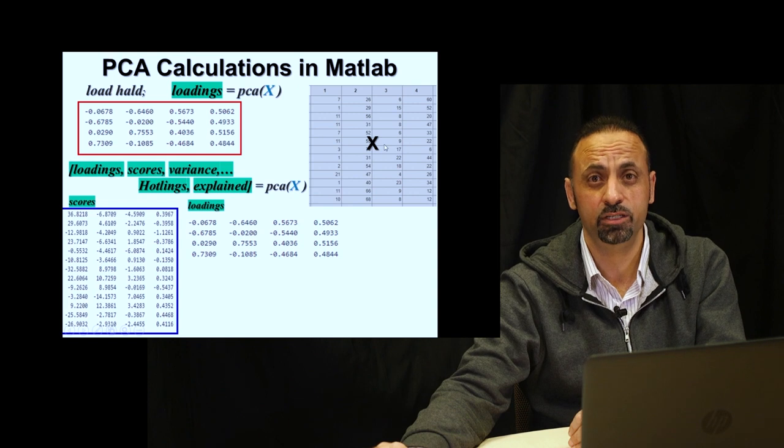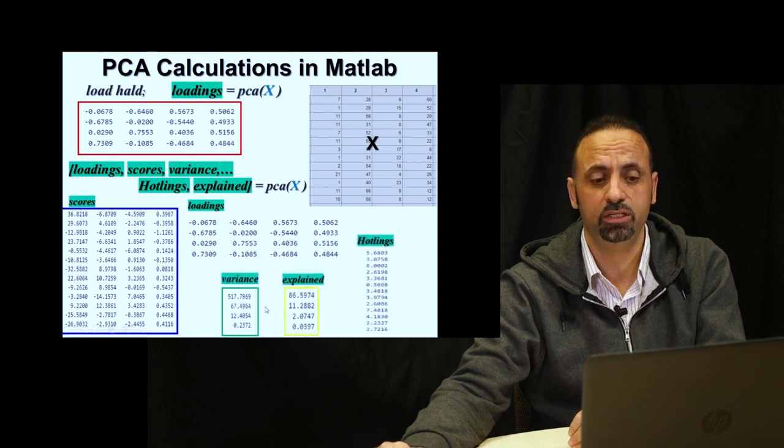Very simple, very straightforward. But if you are also interested in seeing the variation, the explained variation, the cumulative variation, and the Hotelling's, you can even visualize all of this data. It's really interesting to do this in Matlab and very straightforward.